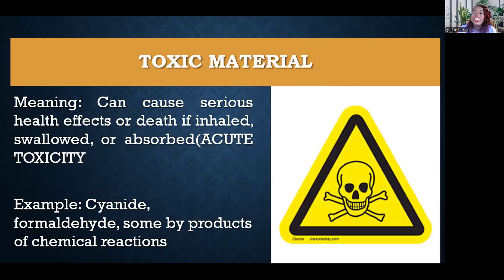We also have a sign for toxic materials — you can see the skull and crossbones. This usually indicates that those substances can cause serious health effects or death if inhaled, swallowed, or absorbed; this is called acute toxicity. Examples include cyanide, which is very dangerous, formaldehyde, and some byproducts of chemical reactions. That is why sometimes you see somebody working on something and they suddenly faint — most probably they have inhaled fumes that caused some sort of toxicity.